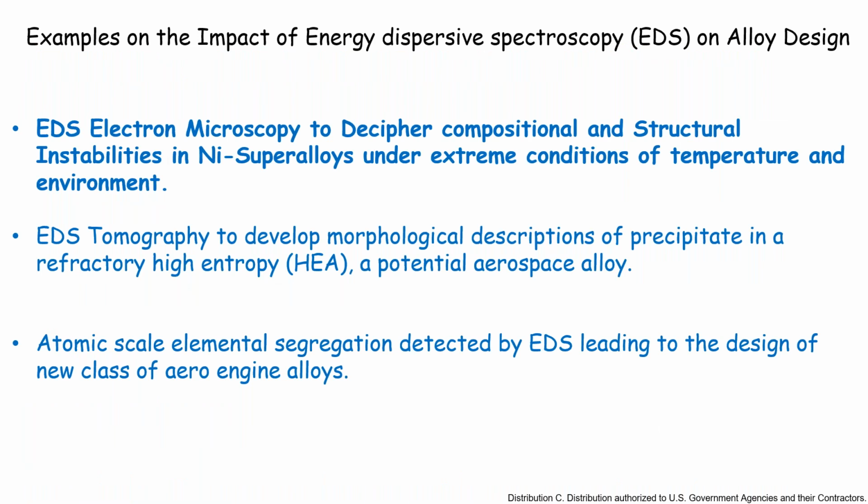I've selected 3 topics that I thought could probably be shared, especially for alloy design, for the metals people here. Because I'm a metallurgist by training, so I look at metals and alloys. If I cannot finish all the 3, I can at least finish the top 2. The first one is a nickel-based superalloy. It's been subjected to a very high oxidation environment. And we'll see that EDS has really helped to locate where the compositional and structural instabilities occur. I'll give some examples of that.